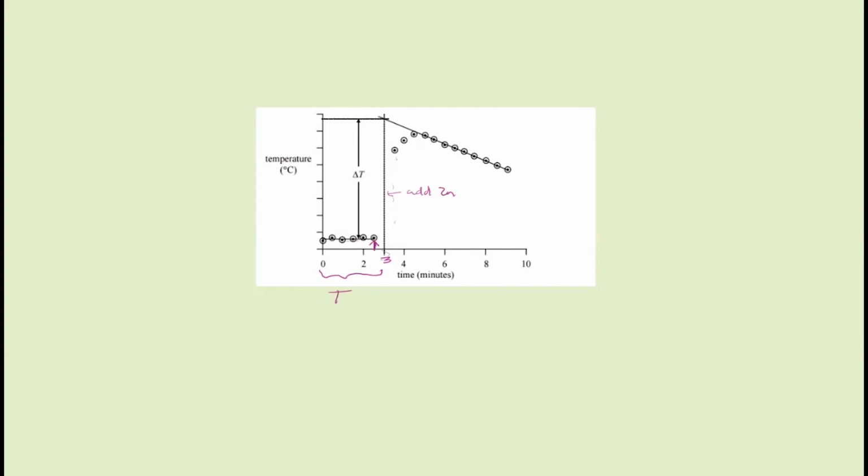And then we continue that measurement every 30 seconds until we feel that we've got enough results here, and we can go up to 10 minutes. I think this one is about 9 minutes. Okay, but we could go up to 10. We could keep going until we achieve these previous values or initial temperatures, but there would be no point. That would be quite a waste of time.